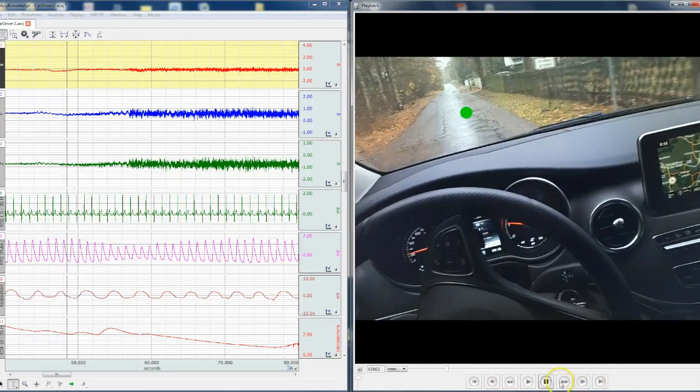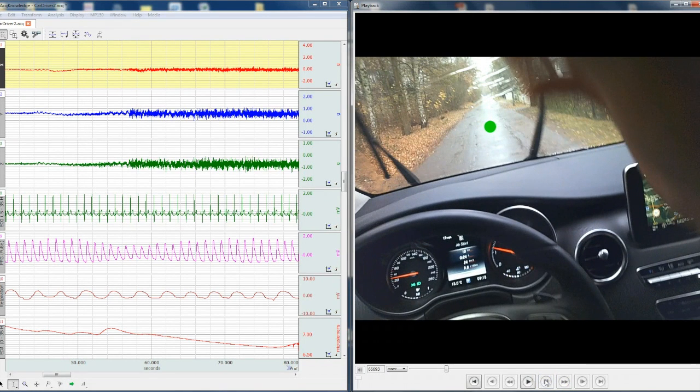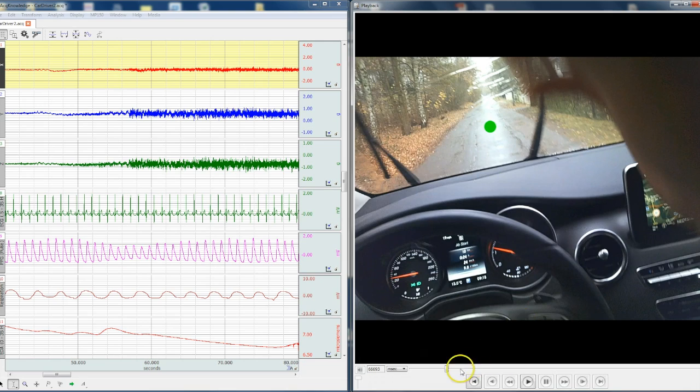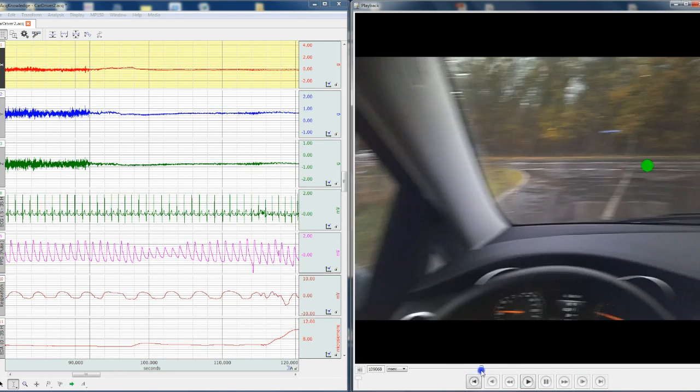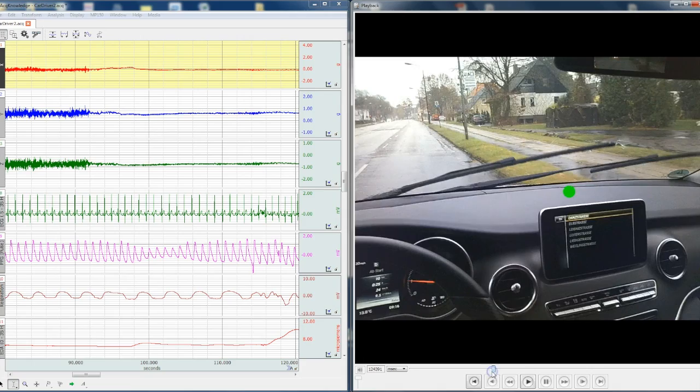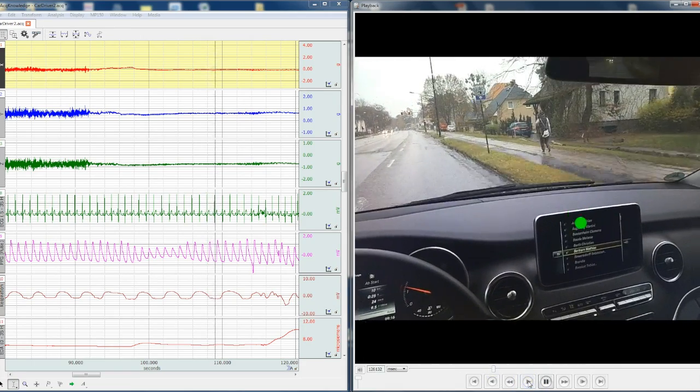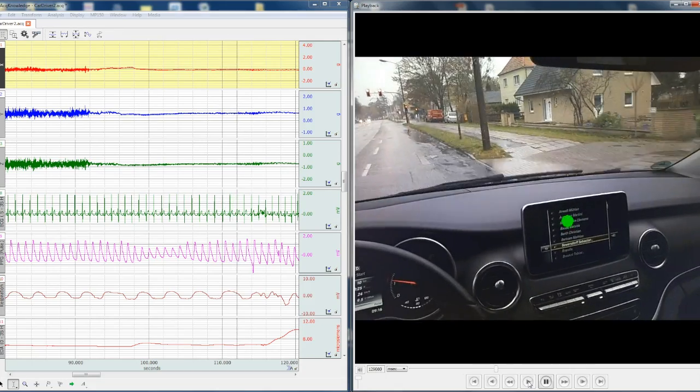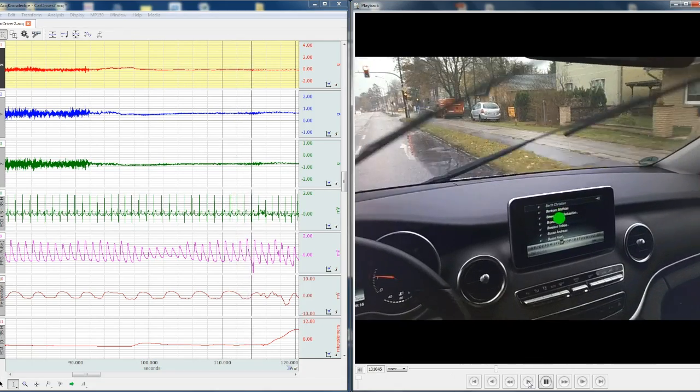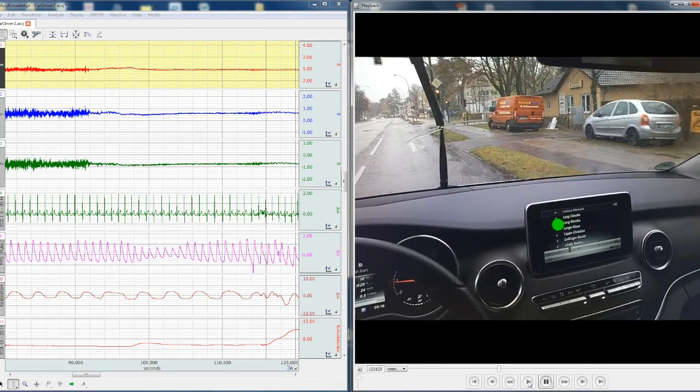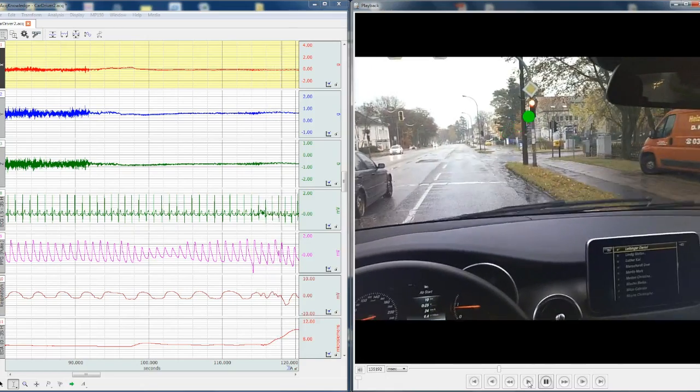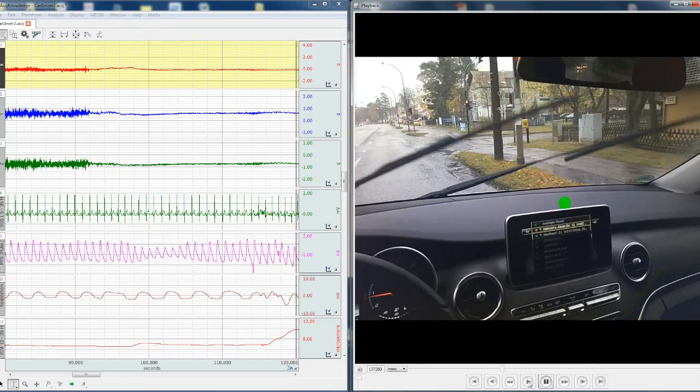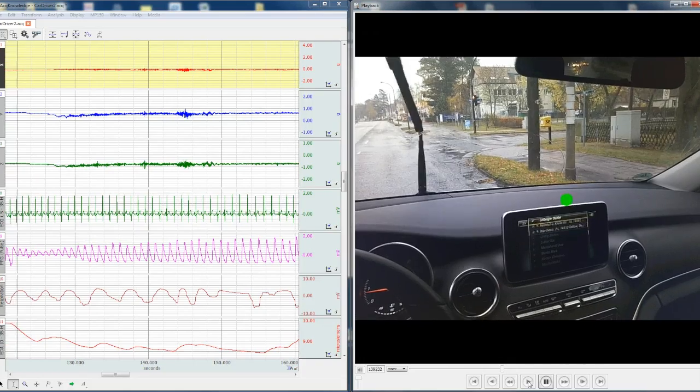Now we have full control over both the video and the physiological data. We can jump through the video to find an area that we're particularly interested in. You can see the driver's being distracted by the on-board display, and we're coming up to traffic lights. There's a lot going on there.